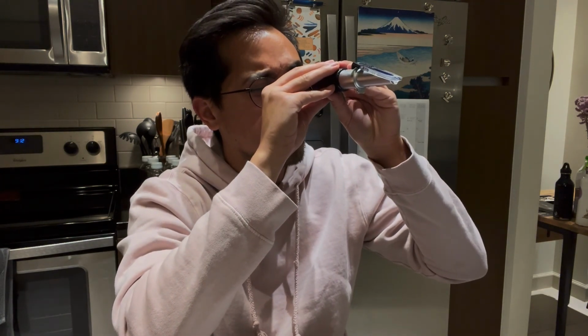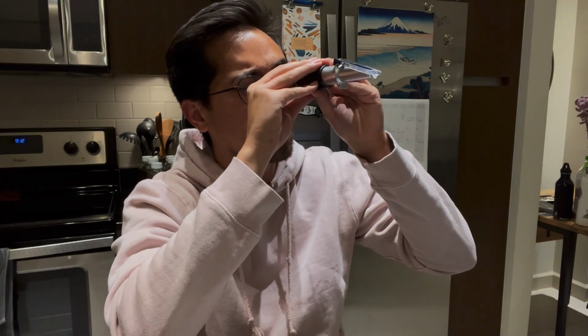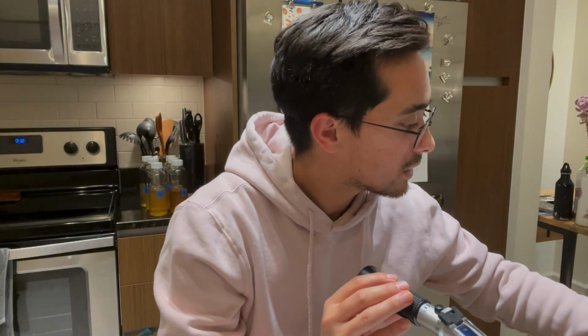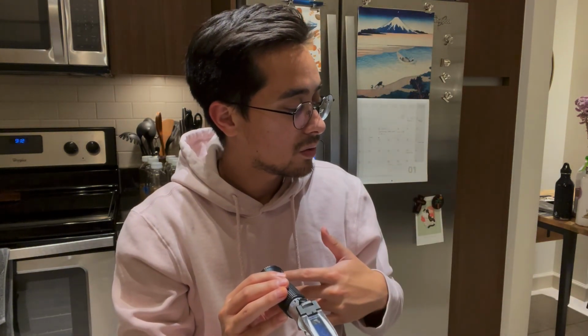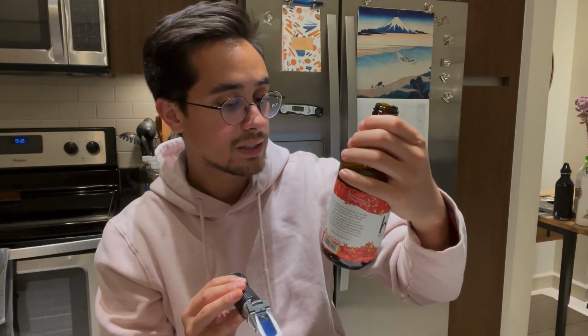All right, this one looks like right around, I'm gonna say 2.6 Brix. So 2.6, 26 grams, divide that by 2, that's like 13. And what they put on the bottle here is 9. But so far, that's the lowest rating that I've gotten from any of these kombuchas. 2.6 Brix on this Hum strawberry lemonade, less sugar flavor. So it's definitely a good one to look out for.